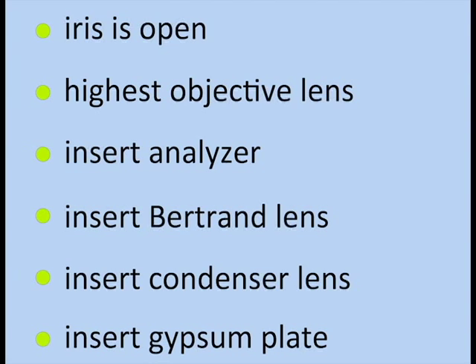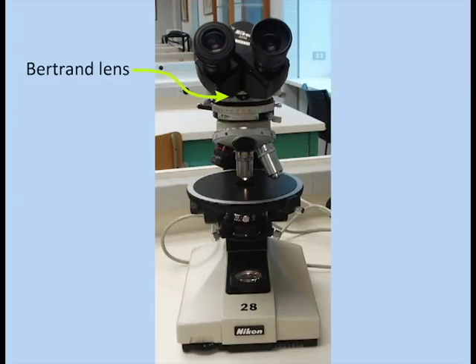To observe the conoscopic figures, you must make sure the substage iris is open, focus on a grain at the highest objective power, insert analyzer, insert the Bertrand lens, and finally insert the condenser lens. If viewing the optic sign, insert the gypsum plate.